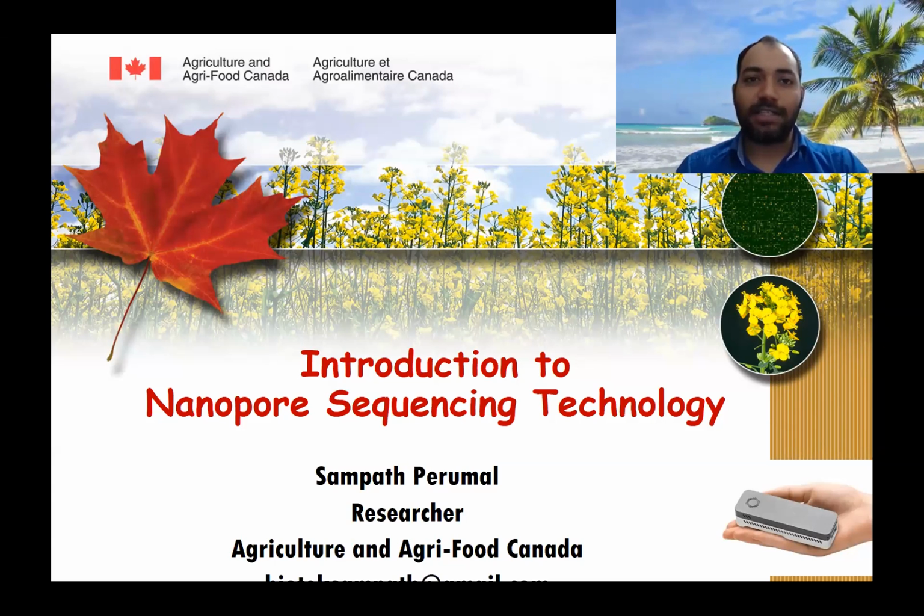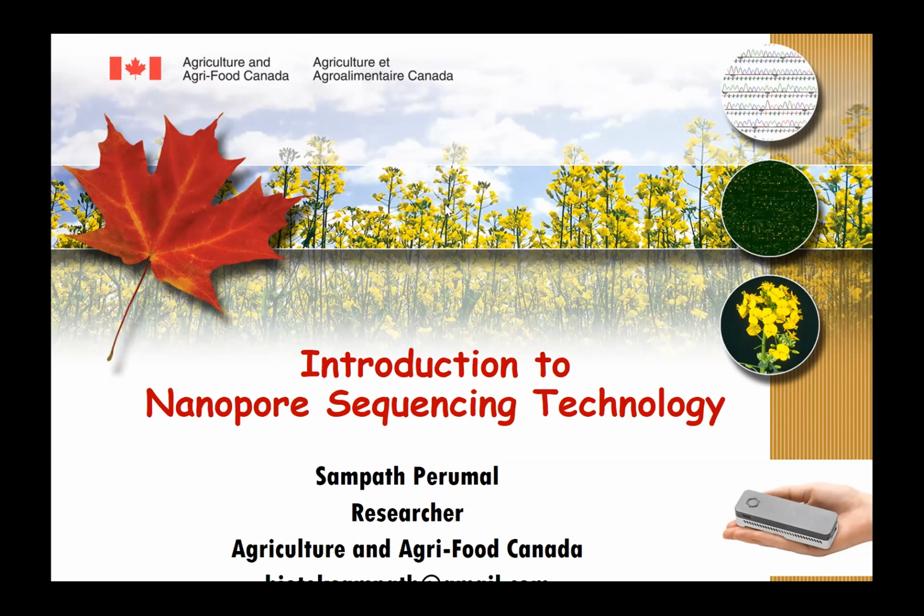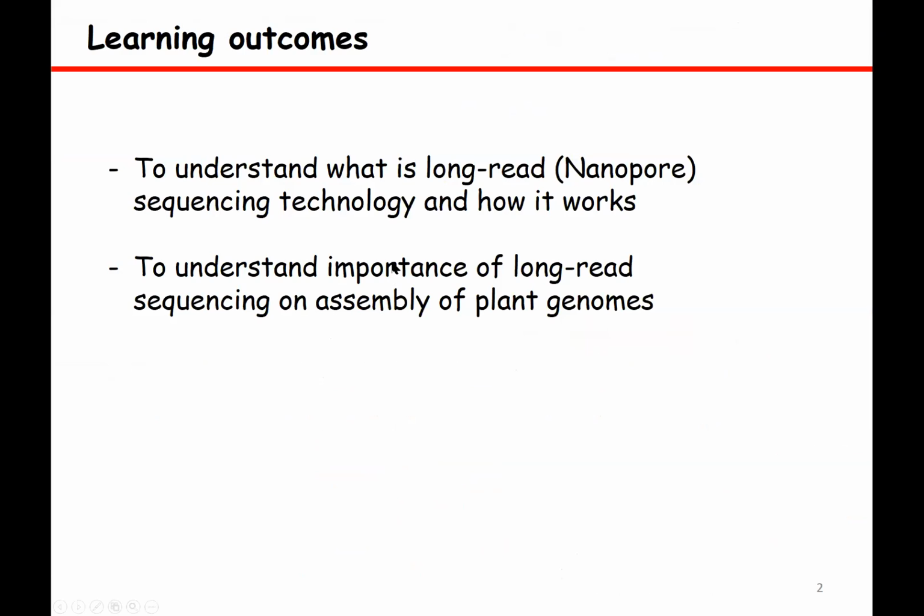For this presentation, I'm going to give an introduction about what nanopore sequencing is and what the impact of this sequencing technology is for genome assemblies. Let me close this video so you won't get distracted. The learning outcome for this presentation is to make sure that you understand what nanopore sequencing technology is and how it works, and also to introduce the importance of long-read sequencing technology for assembly of plant genomes.